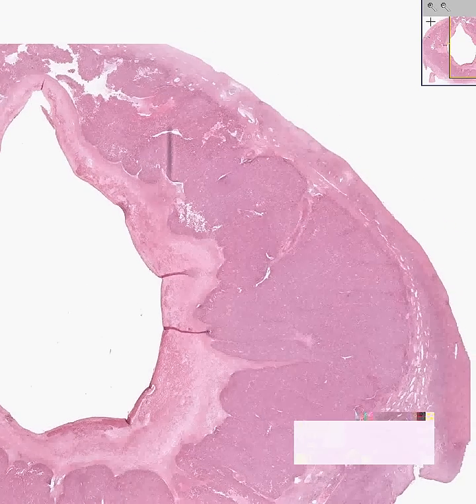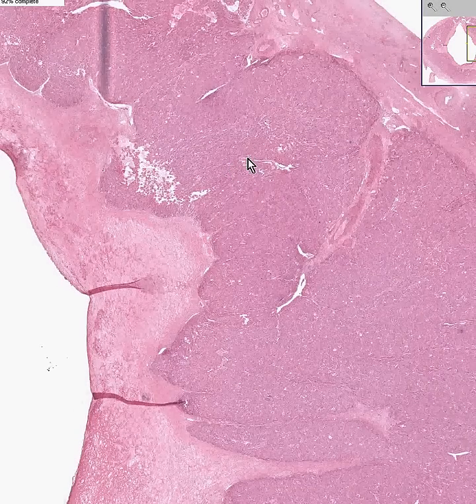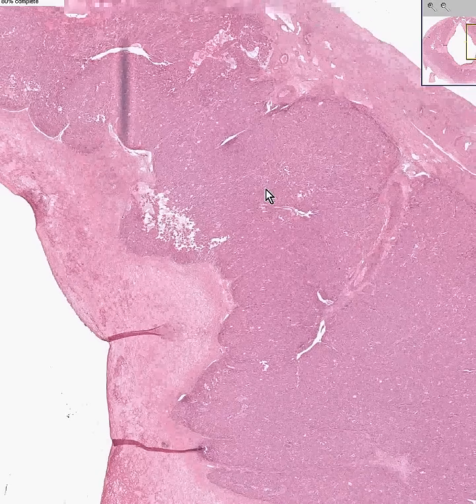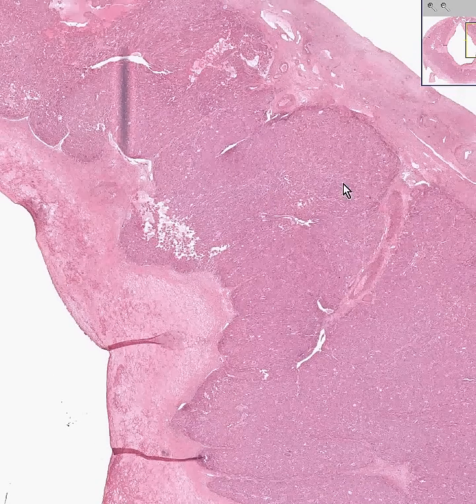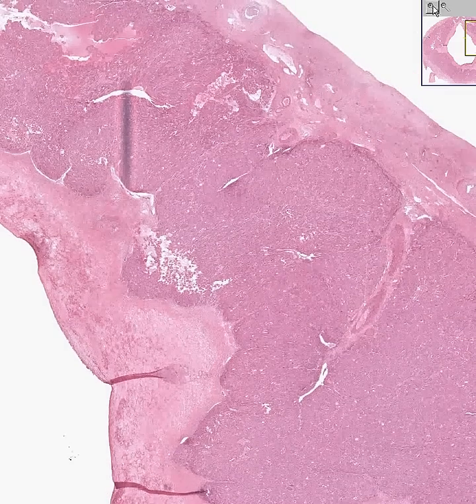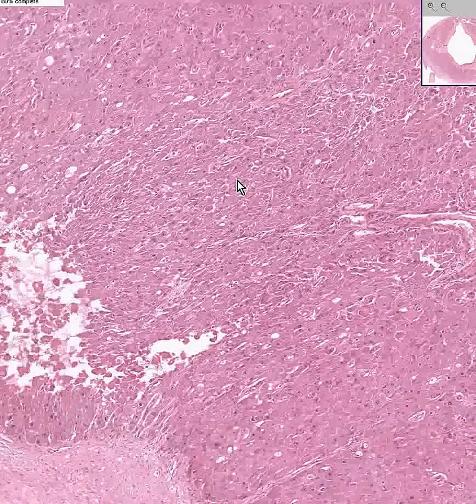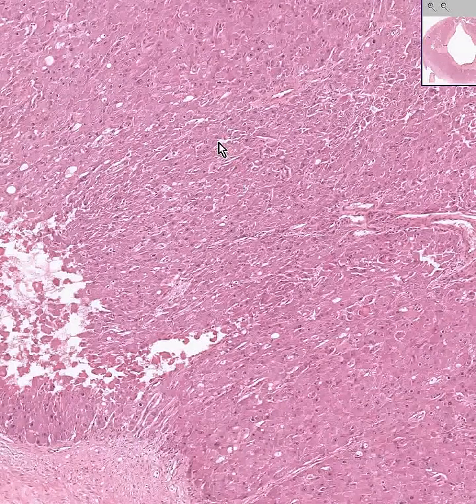The corpus luteum is also very endocrinologically active, but instead of having granulosa cells, it has luteal cells. It is a very vascular structure.